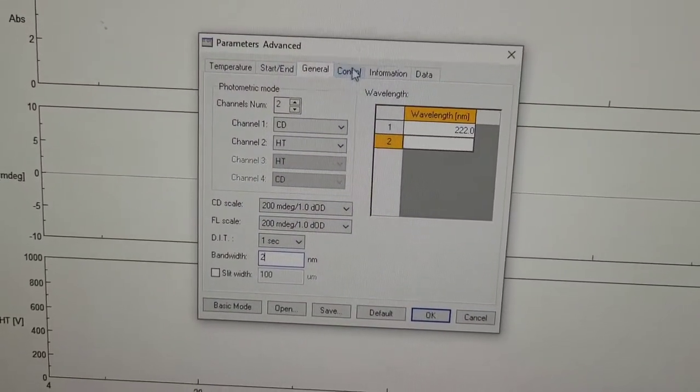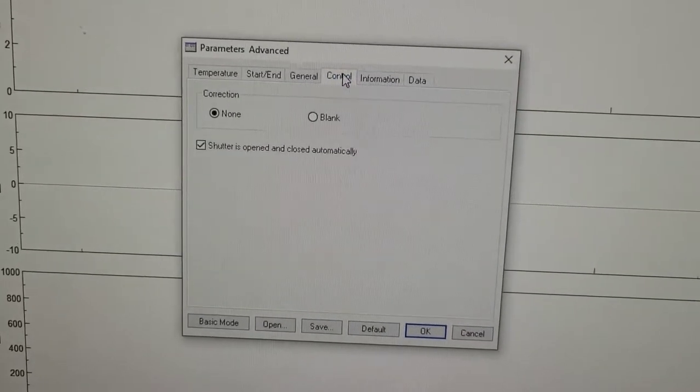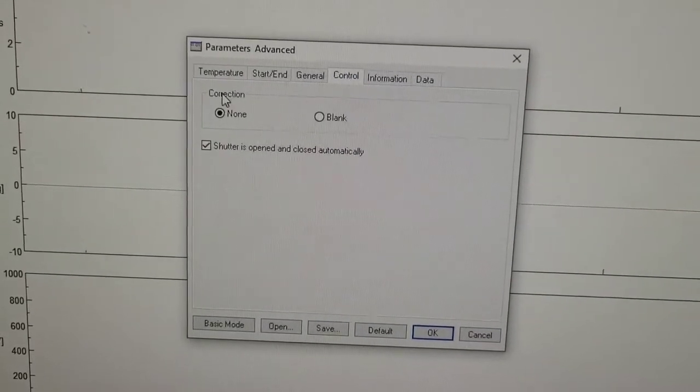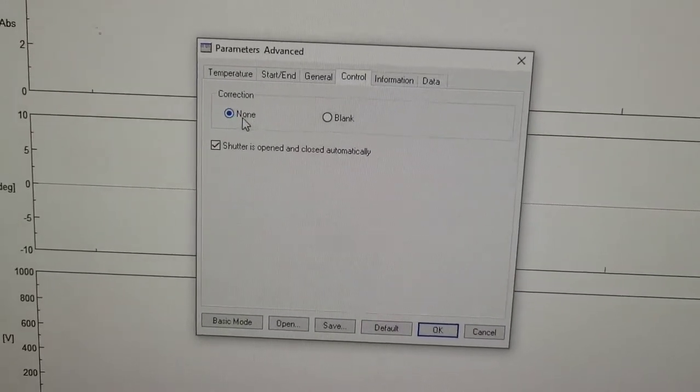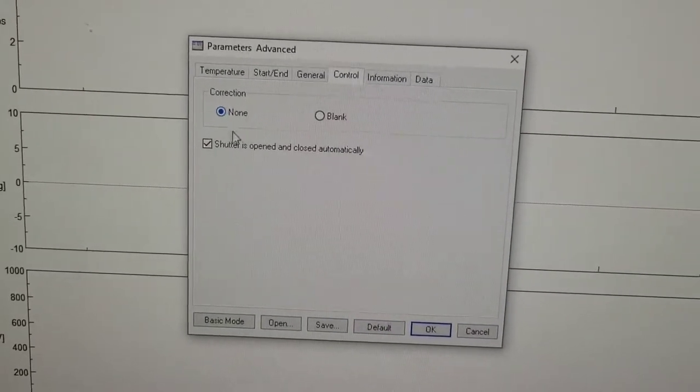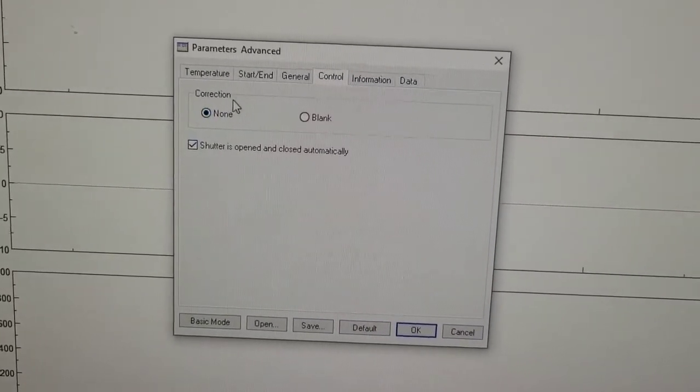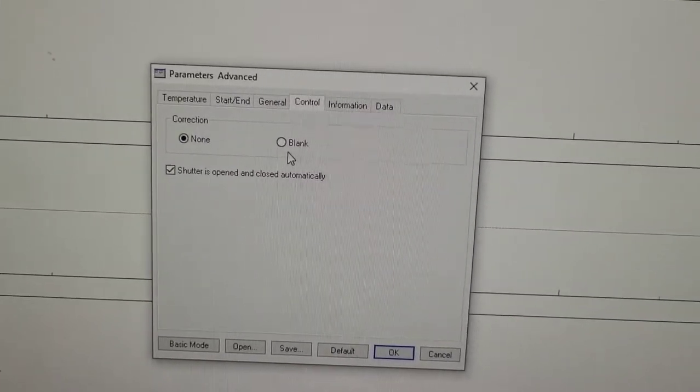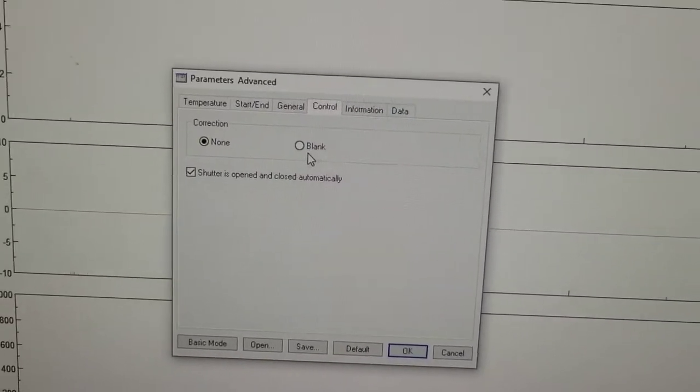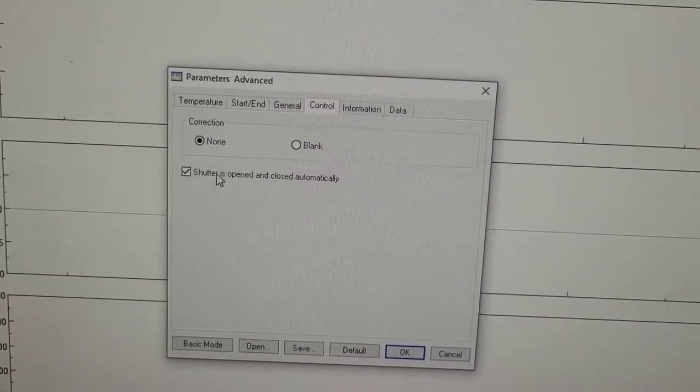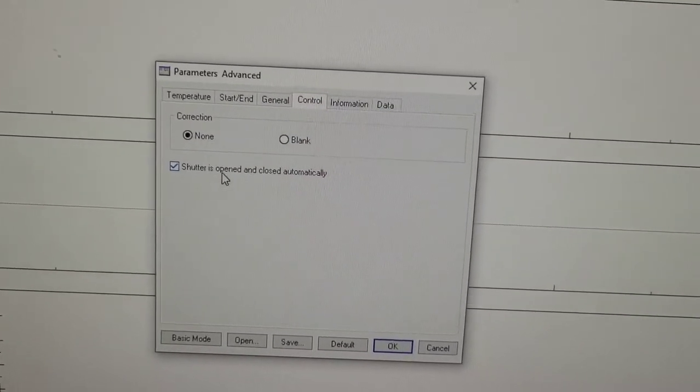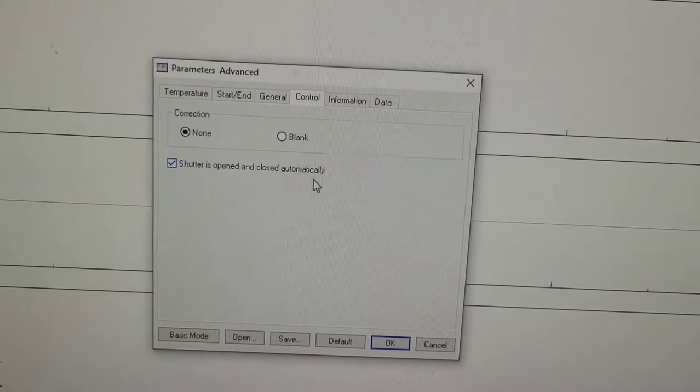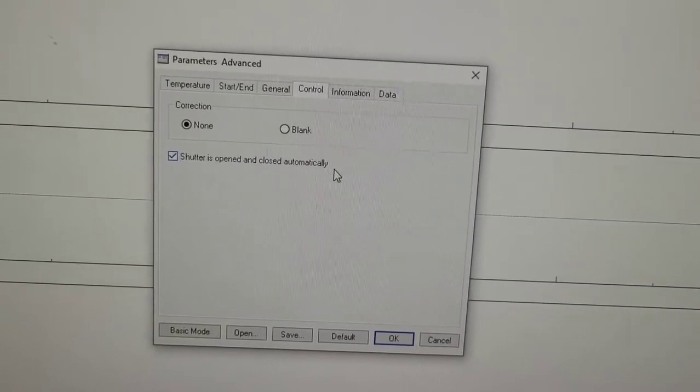Then going to control correction. I don't want any, but if you want to correct it with a blank, you can do that. Shutter is opened and closed automatically, yes.